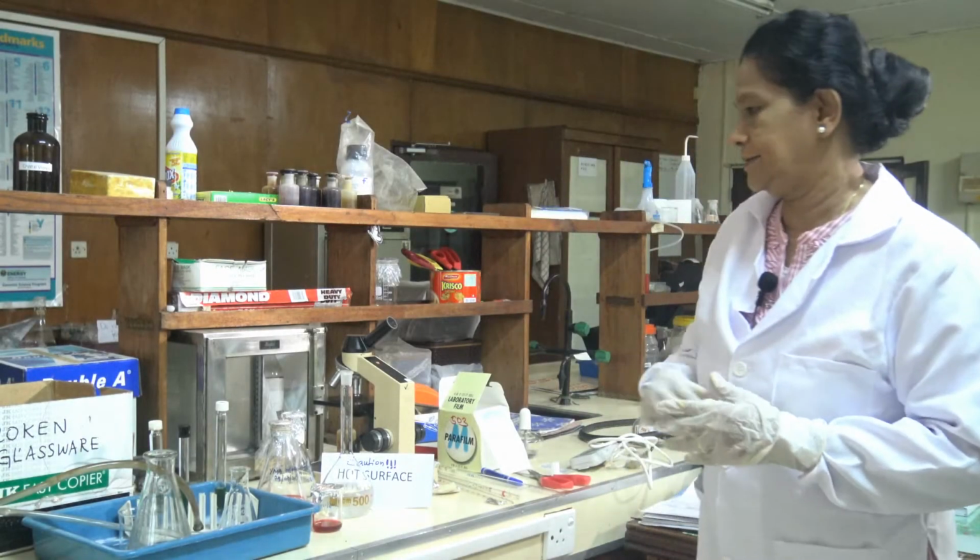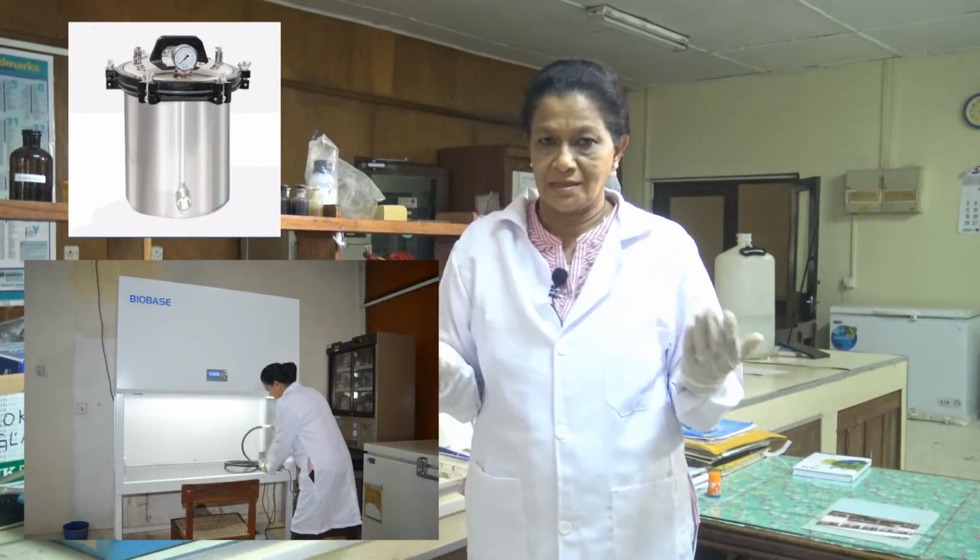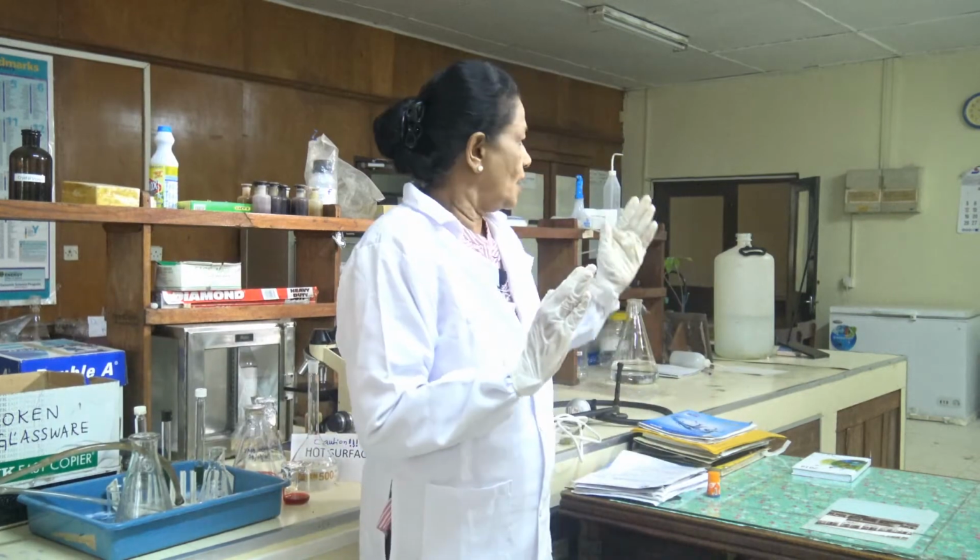The third material we need is electricity. We use many electrical equipments in the laboratory: oven, hot plate, autoclave, laminar flow, etc. Always check the wire which comes out from the machine is free from cracks or damages.